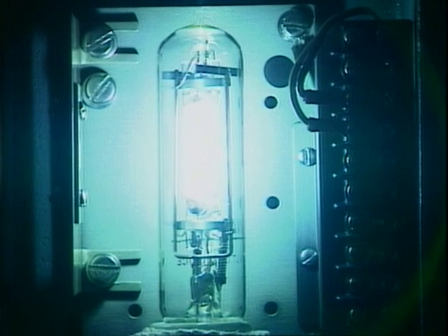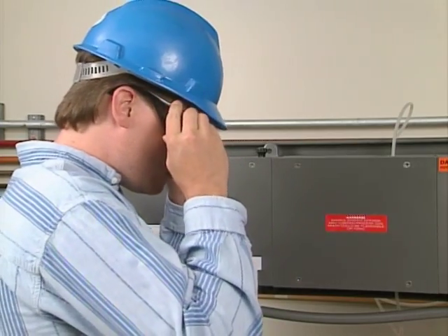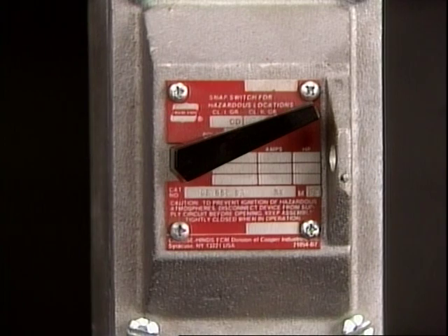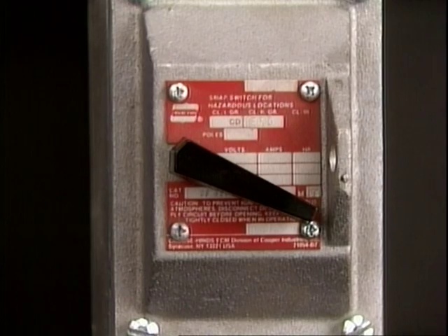It's important to remember that the light source of an ultraviolet analyzer emits radiation, which is dangerous to the eyes and skin. Wear protective eyewear and clothing and avoid direct exposure to the light source. Always disconnect the analyzer from all power sources before beginning any corrective maintenance.